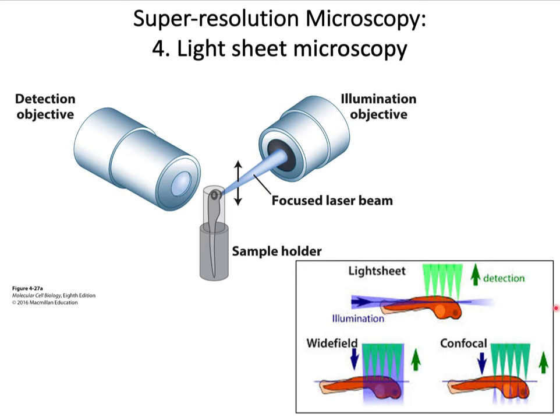As a comparison with the other conventional fluorescence microscopic techniques, in the wide field fluorescence microscope, the whole sample is excited by the excitation wavelength and it emits the emission wavelength to be detected. In the point scanning confocal microscopy, each point on the sample is excited individually and the information of the emission light is also collected individually and later merged together to form the image.